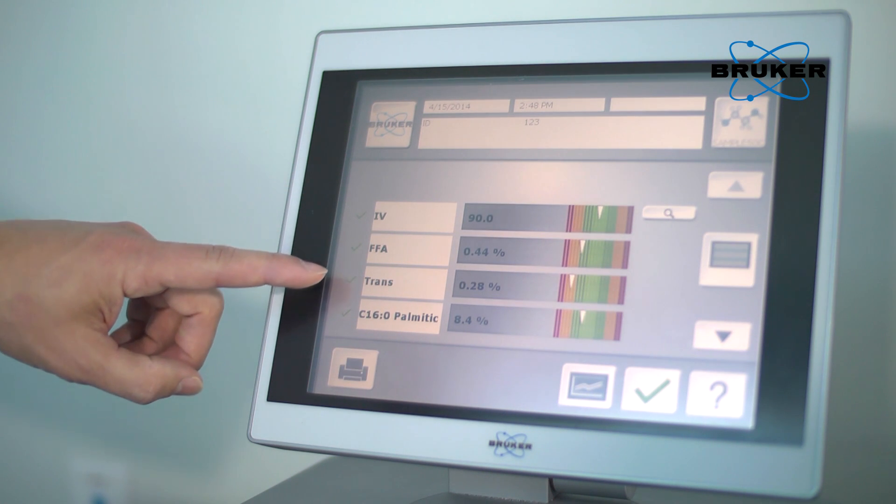One last push of a button, if required, the stored result can be exported via USB at any time.